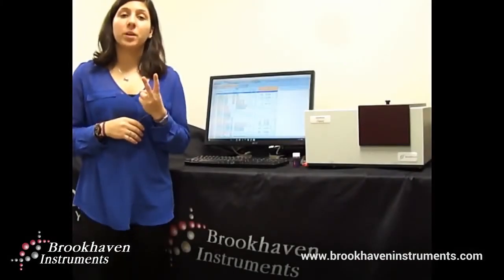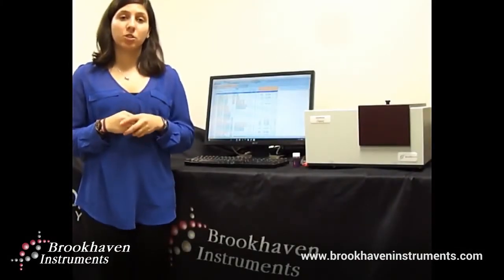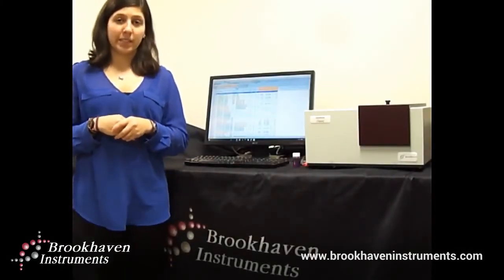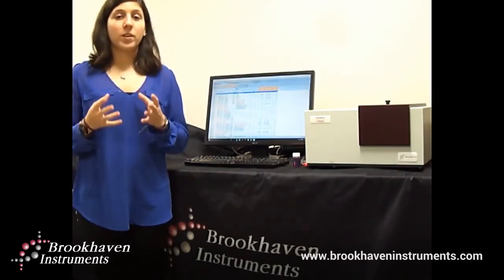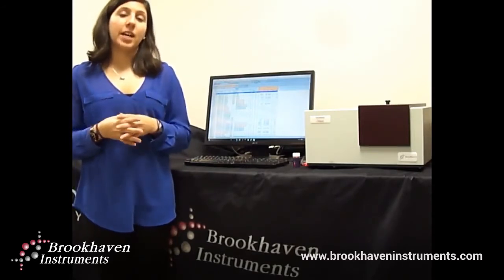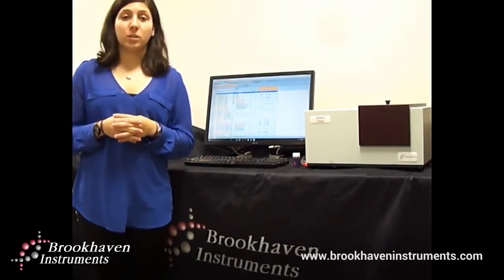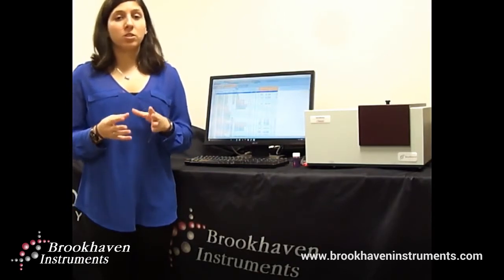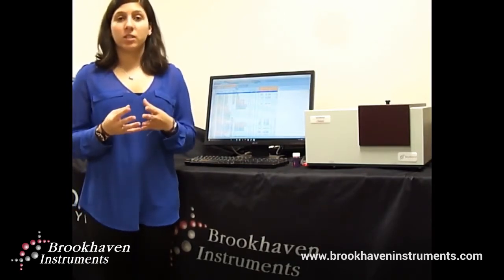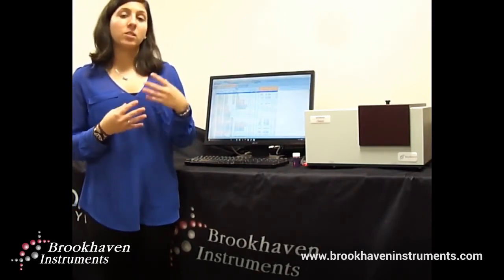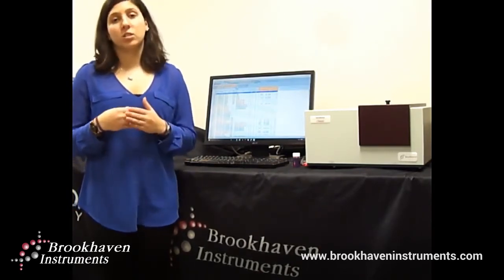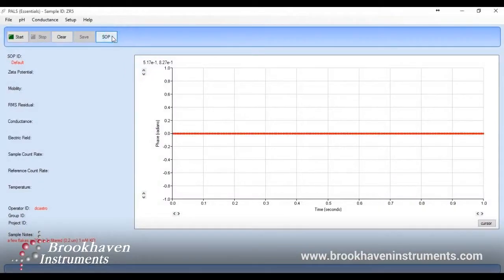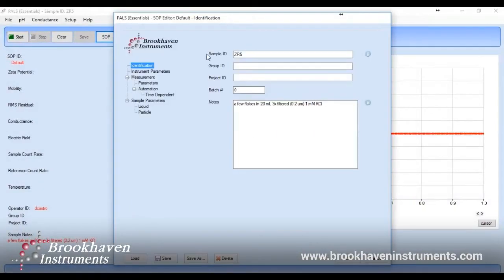We offer two methods of zeta potential measurement: electrophoretic light scattering, also known as ELS, or phase analysis light scattering, also known as PALS. PALS is a more sensitive method that's especially useful for tougher samples that have high salt concentrations or low mobility. Let's set up a PALS measurement.